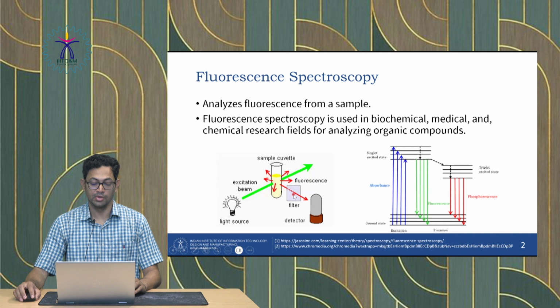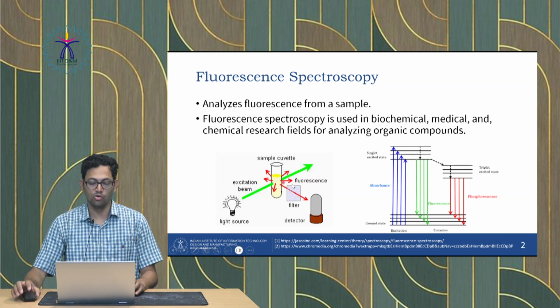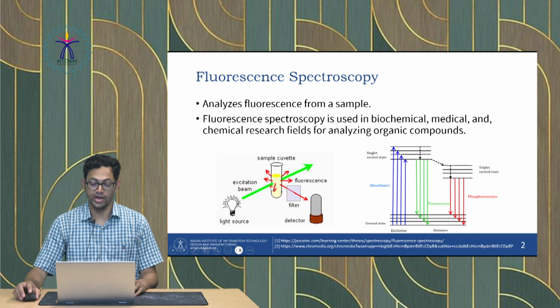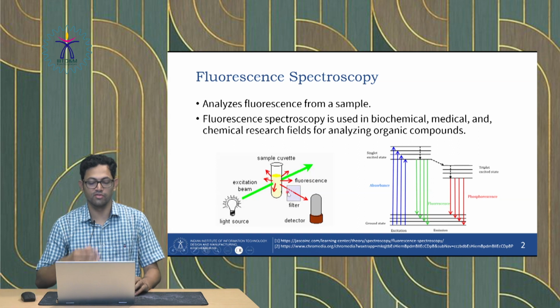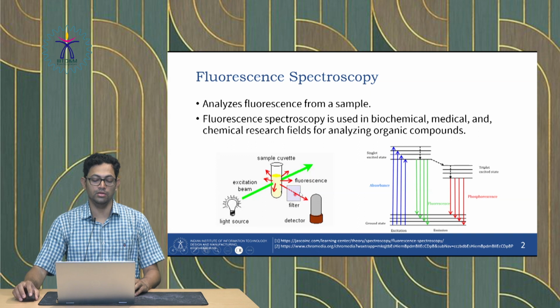And what we will have is a filter, and the output of this cuvette would be the light scattered from this light source. For example, if it is a green light, the green light will be scattered in all directions. In addition to the green light, there would be higher wavelengths of light, for example in the red color, that we allow to pass through and get detected.